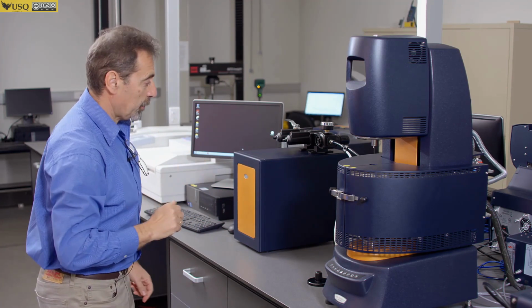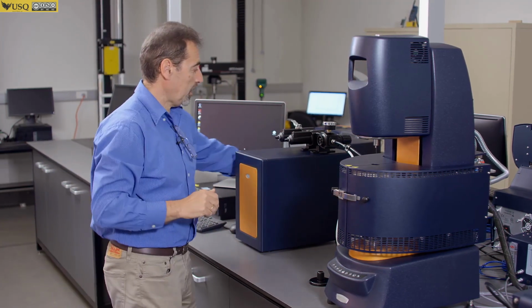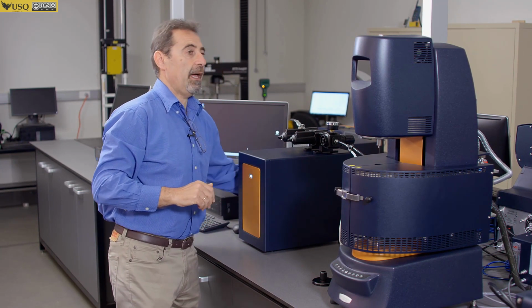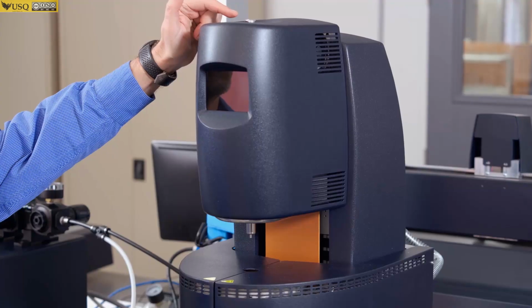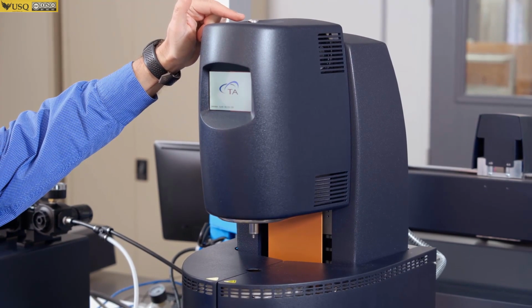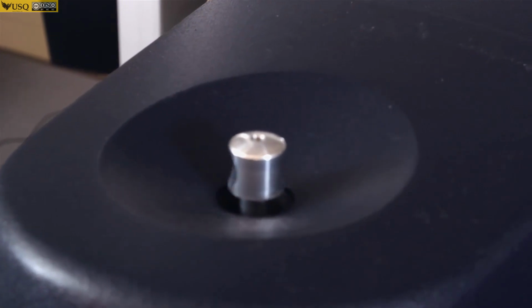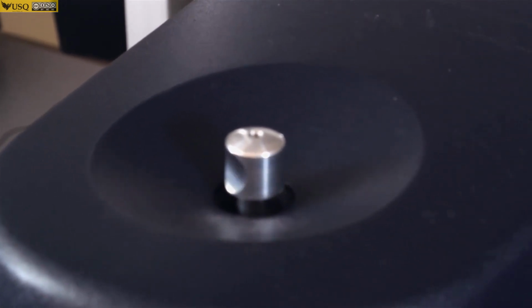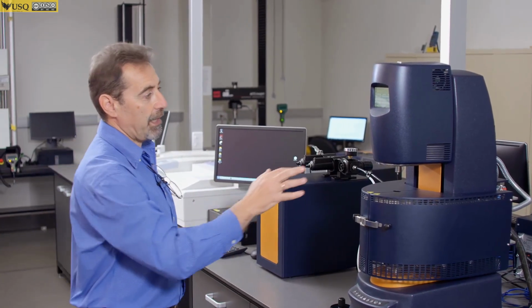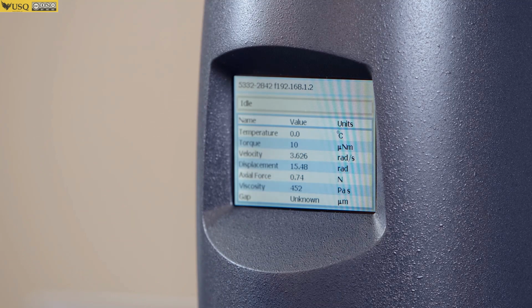After that, we're ready to switch electronics on, and when everything is working fine, you should see this shaft raising up and starting to spin, like that. Okay, so that's an indication of all correct operations, and then you will see your signals, and if everything's working fine, you should not see any errors.